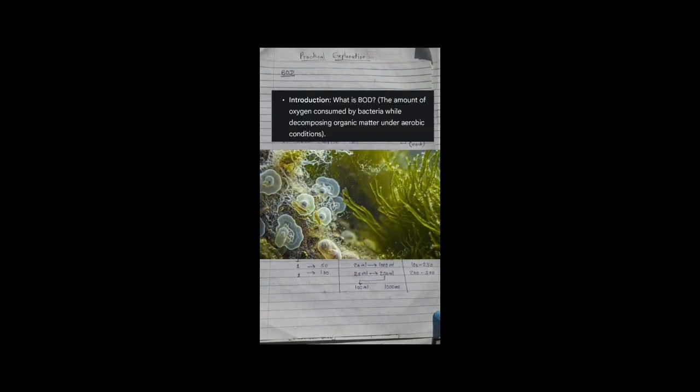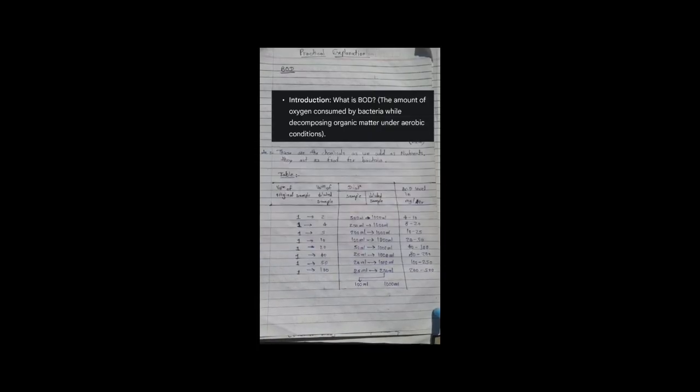My name is Sarthak and today we discuss the BOD practical. The oxygen which is consumed by the bacteria for the degradation of organic matter which is present inside the water sample is called the BOD. That means the requirement of oxygen by the microorganisms for the degradation of that organic matter is called the BOD.